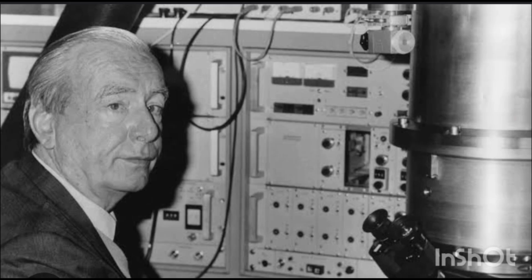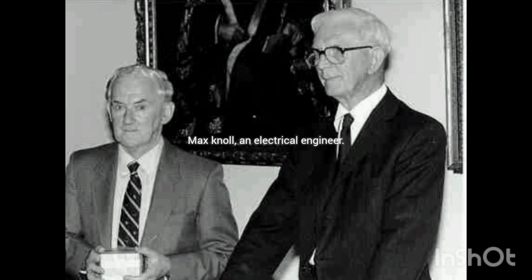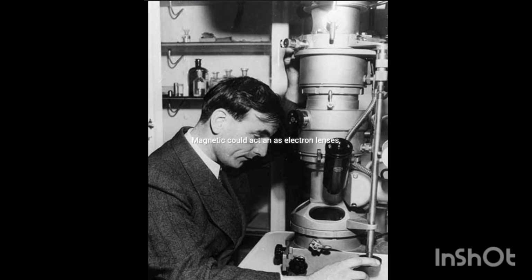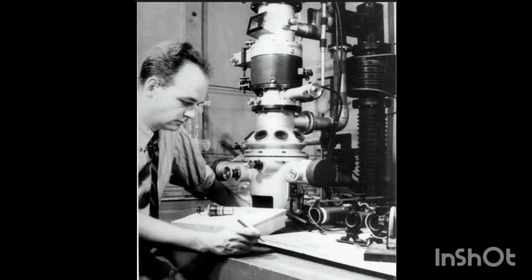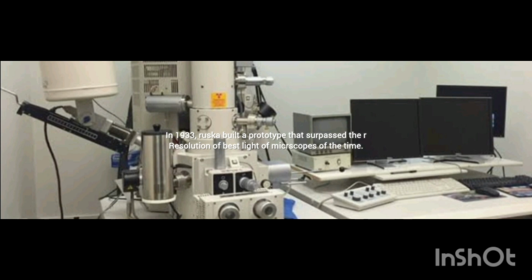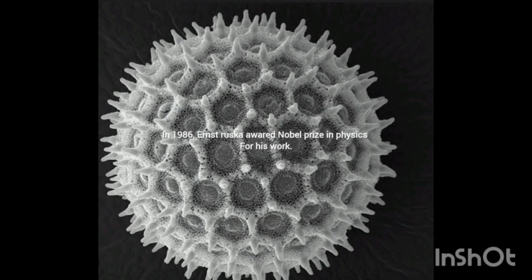The first electron microscope was developed in 1931 in Germany by Ernst Ruska, a German physicist, and Max Knoll, an electrical engineer. They built the first transmission electron microscope at the Technical University of Berlin. Ruska demonstrated that magnetic coils could act as electron lenses, focusing the electron beams in the same way that glass lenses focus light in optical microscopes. By 1933, Ruska had built a prototype that surpassed the resolution of the best light microscopes of the time. In 1986, Ernst Ruska was awarded the Nobel Prize in Physics for his work in developing the electron microscope.